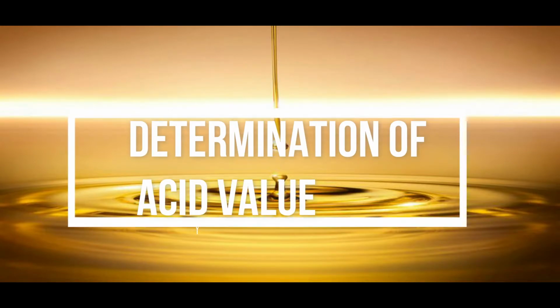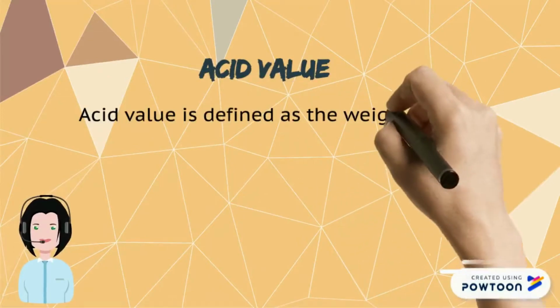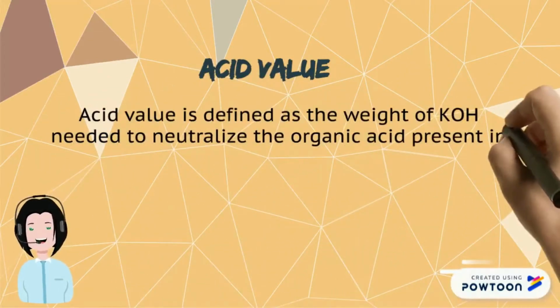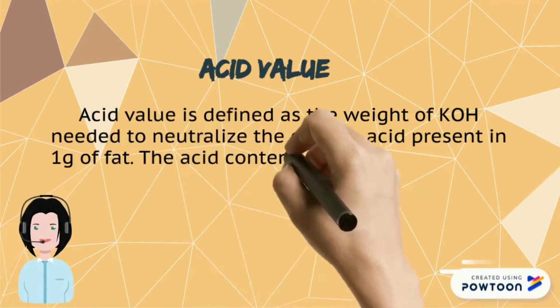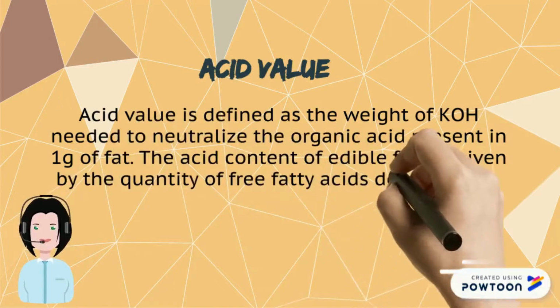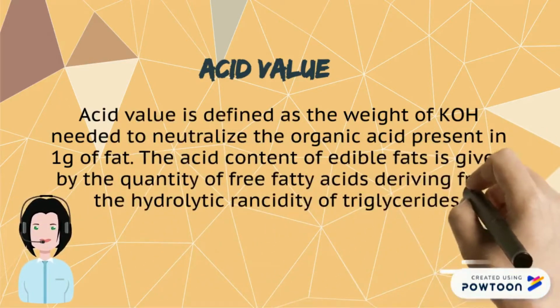Determination of acid value. Acid value is defined as the weight of KOH needed to neutralize the organic acid present in 1 gram of fat. The acid content of edible fats is given by the quantity of free fatty acid deriving from the hydrolytic degradation of triglyceride.